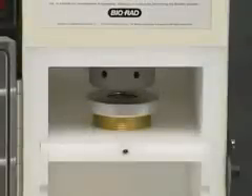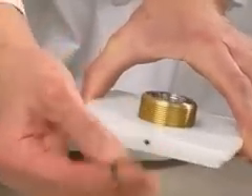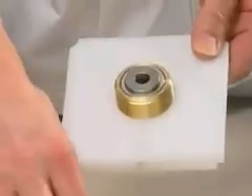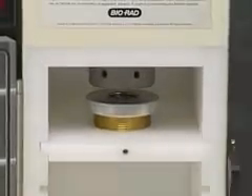Set the distance between the rupture disc retaining cap and the micro carrier launch assembly. Release the set screw. Assemble the micro carrier launch assembly, then insert the fully assembled micro carrier launch assembly on the highest slot within the chamber. The set screw on the white plastic shelf should face outward. A quarter inch distance is recommended for initial experiments.